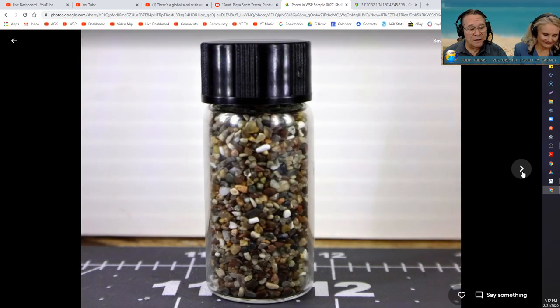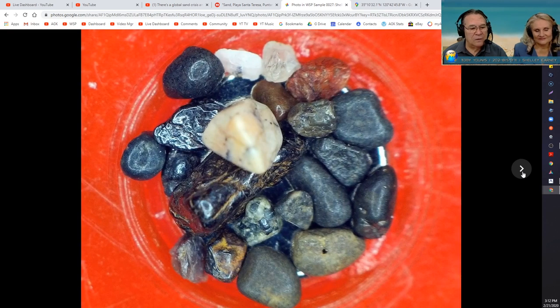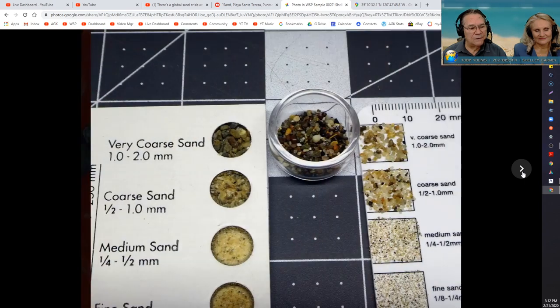Very colorful. If you were to stand back from it, it would show up as brown gray rather than some of the most recent samples where it shows up as white or light white. There was some magnetism in some of the rocks in the sample, and I think I already said it, most of the sample is rocks, and I think I can explain why when we take a look at the maps.